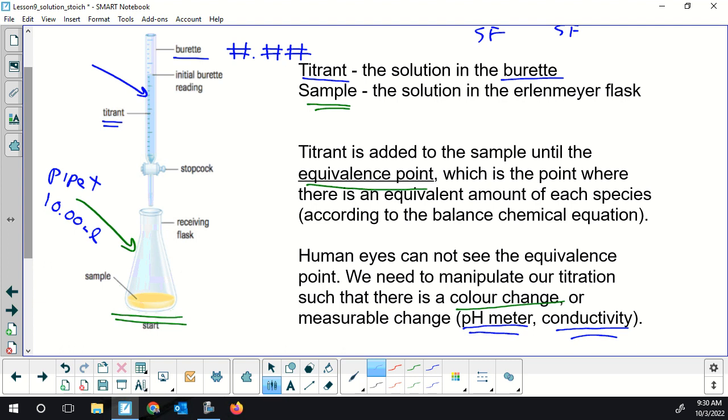So the heart of science is A, experiments should be reproducible, and B, we get more confidence in our data when we average repeated trials. We reduce random error. Now, systematic error is kind of the really bad type of error. Random error is just fundamental to using equipment.